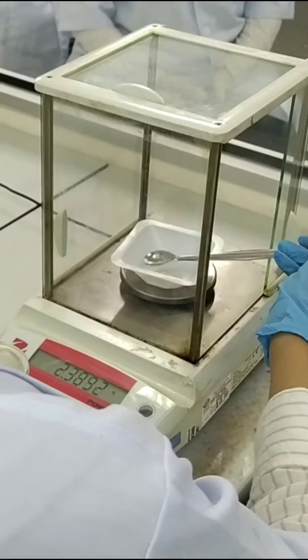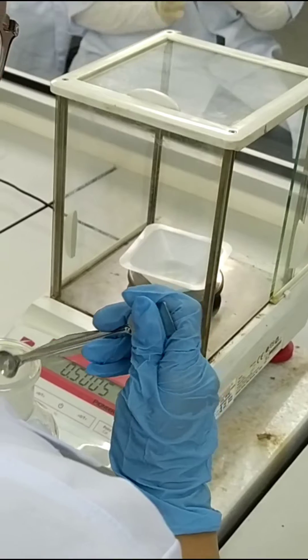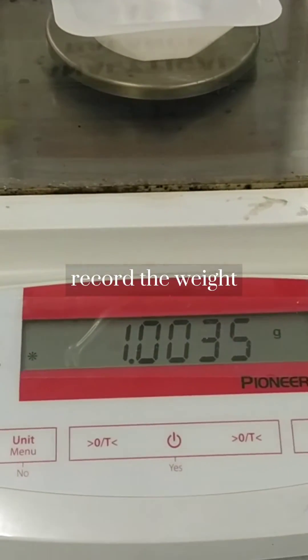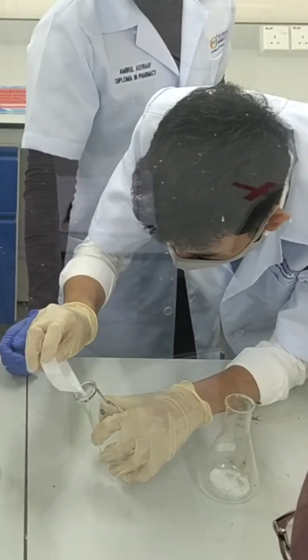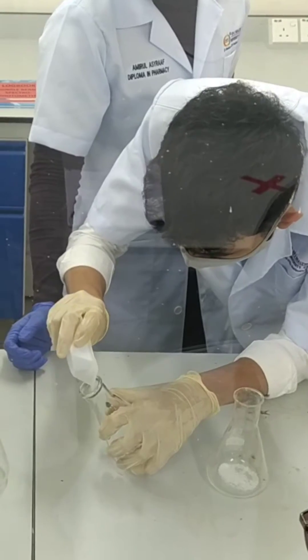Place the weighing disc carefully, gently putting in the samples. Record your weight and fill it in the conical flasks.